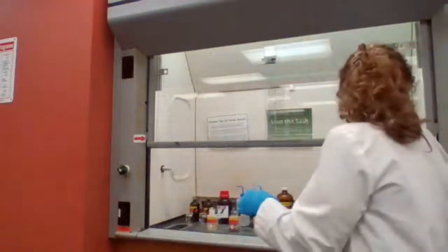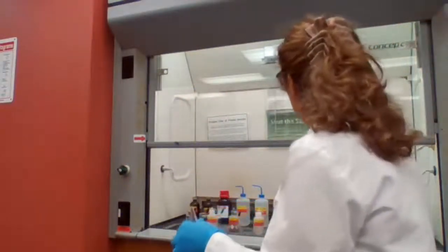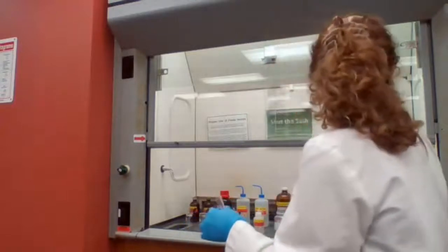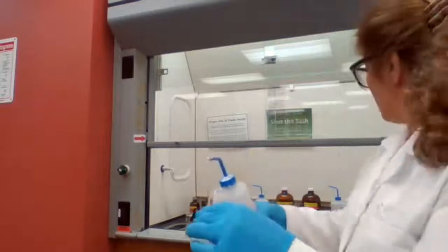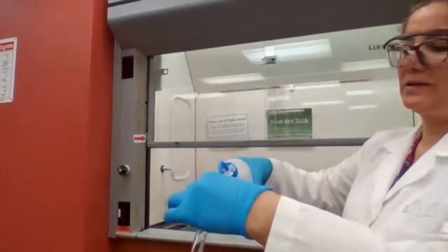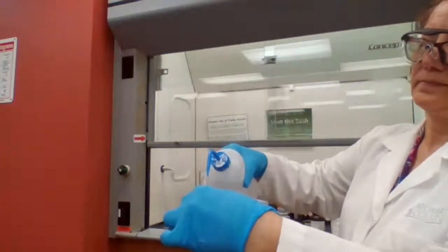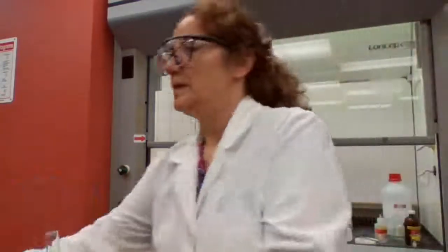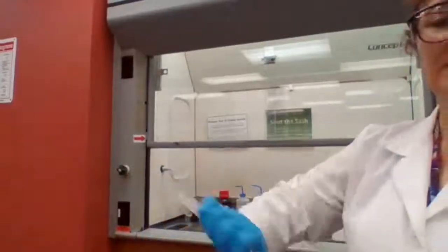And this time, we are adding 5 milliliters of sodium hydroxide, and we mix it.